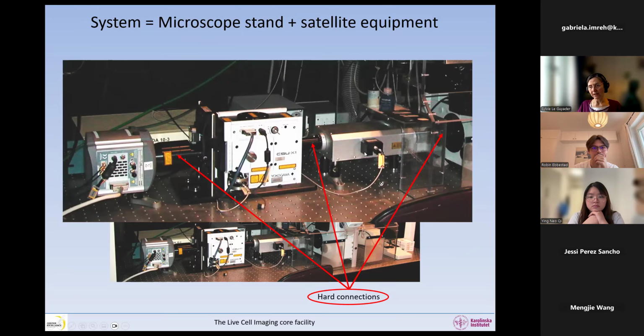If you can identify this type of equipment, then you can identify all types of microscope just by looking at them. And this is quite simple. We need to be able to recognize a camera, and we will see that there are lots of different shapes. We need to be able to recognize a scanner. There are also lots of different shapes, and then a few more things.